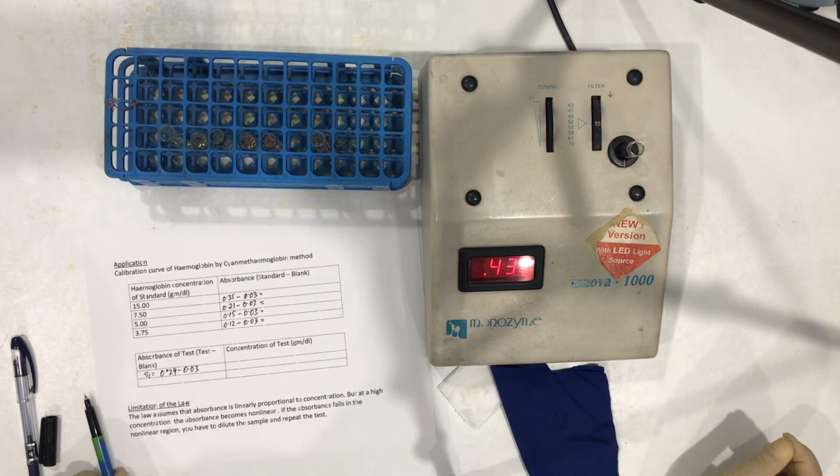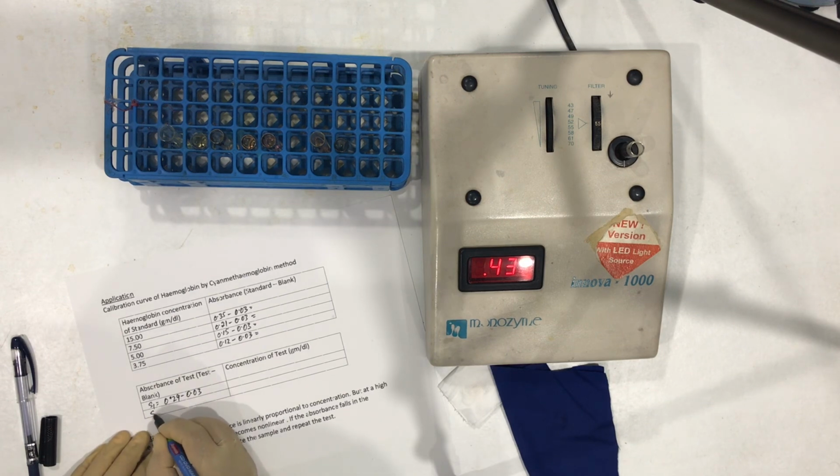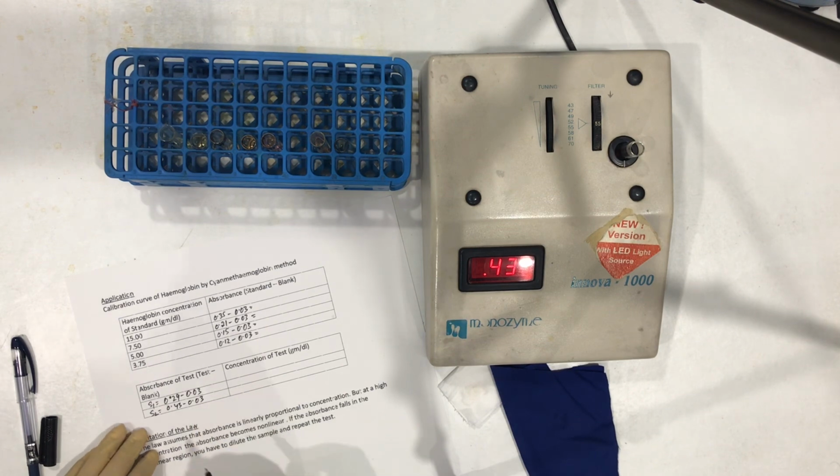So S2 is giving absorbance of 0.43 minus 0.03.